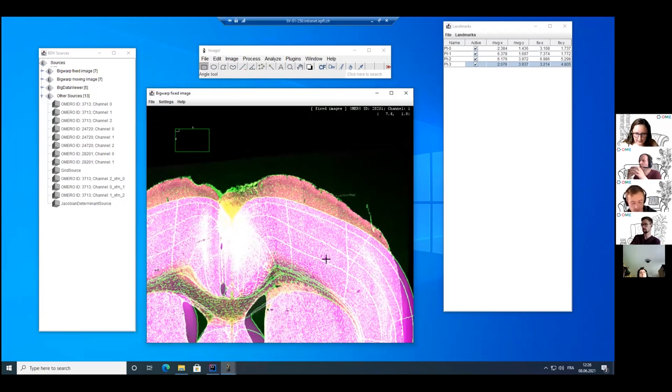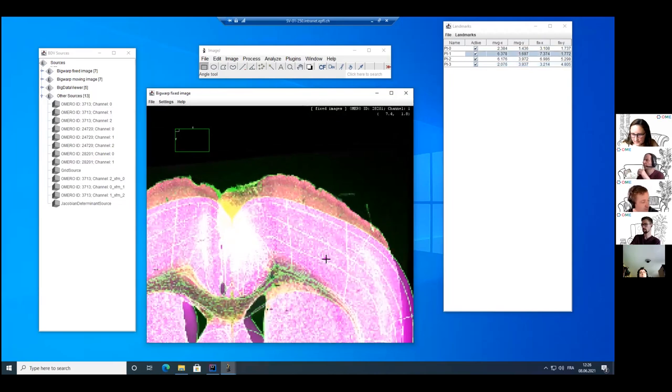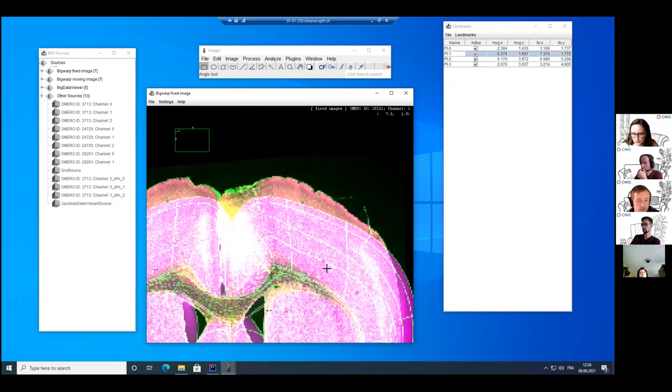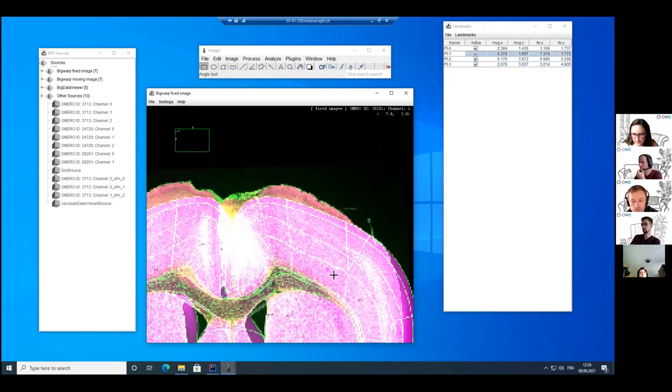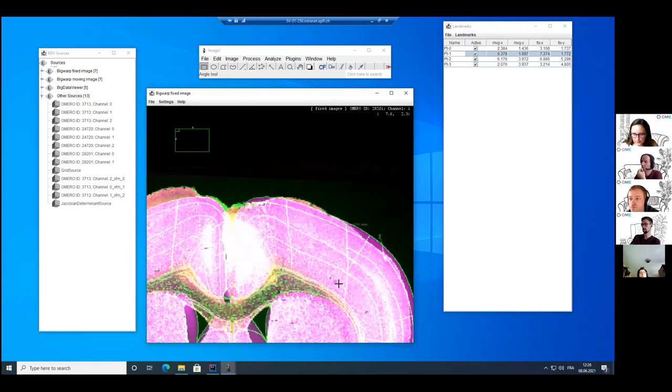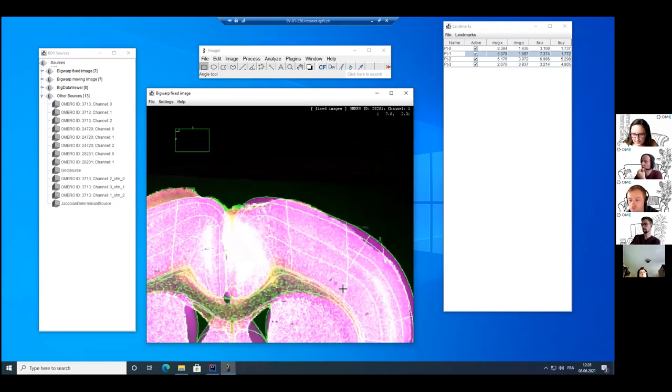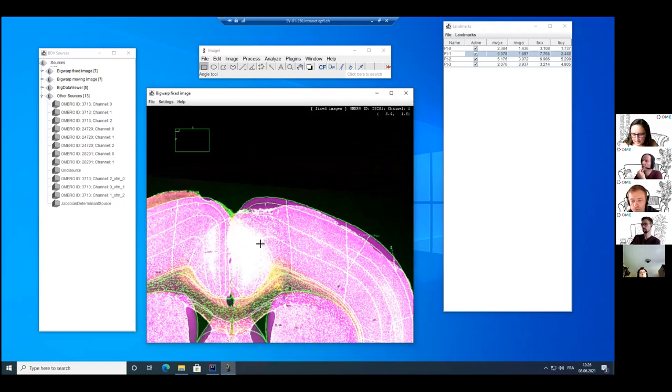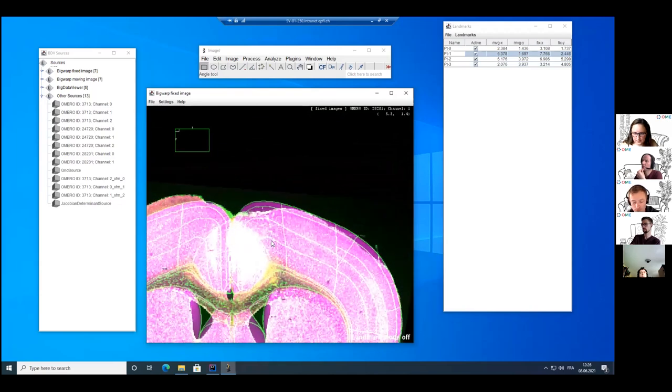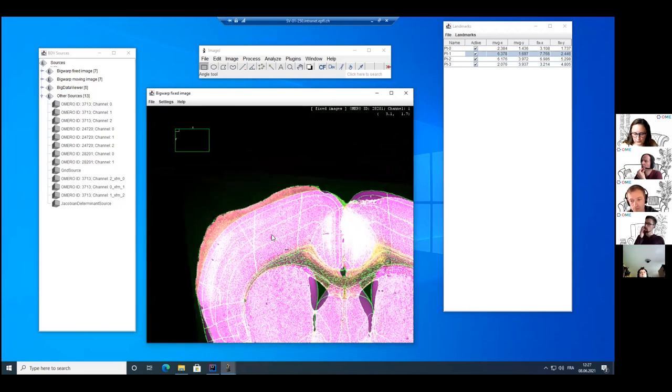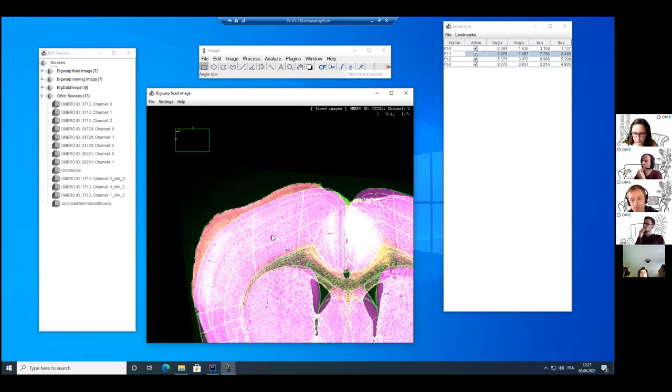So let's select this point, move the source like I want to align it a bit, scroll back and move those four points.